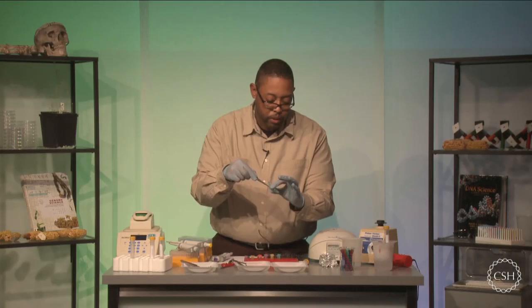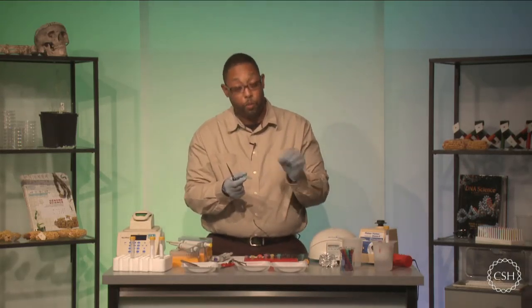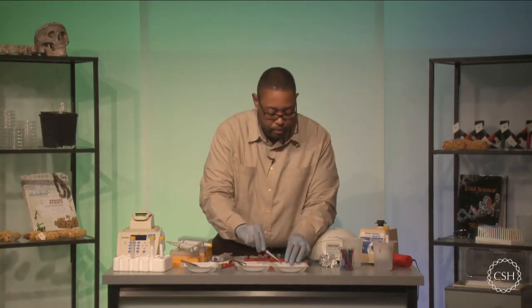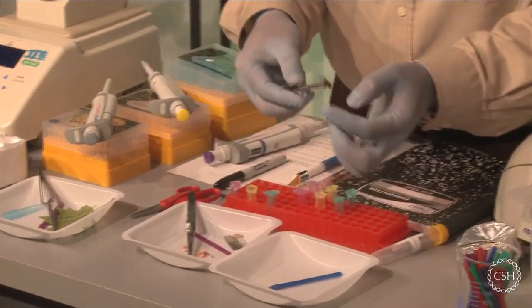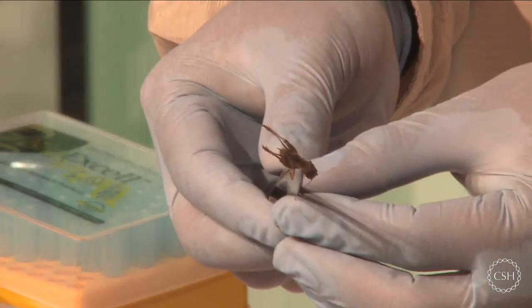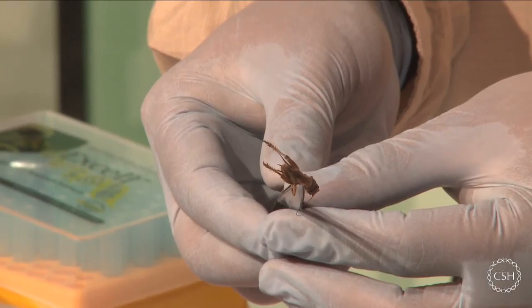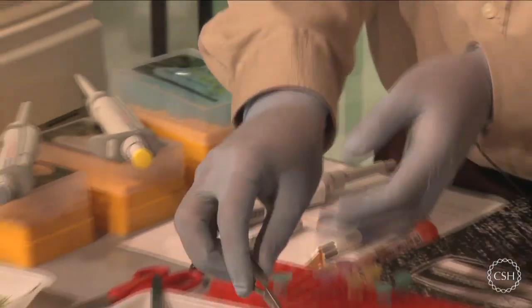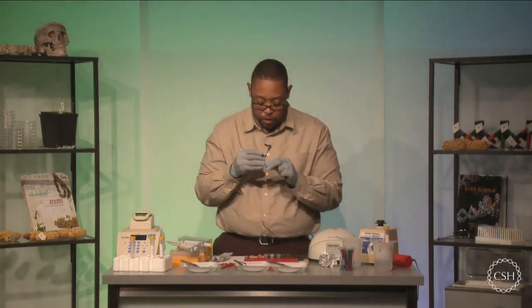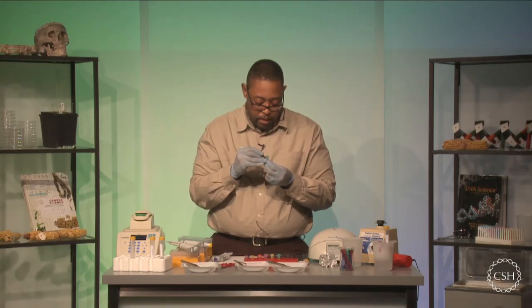Now you may wish to add 2 legs, 1 leg. You can pretty much use any particular number between 1 and 2 legs, but if you have a large back leg, like for example, the cricket here has a large set of back legs. You can use one of those or 2 of the smaller legs here in the front. So 1 of the back legs or 2 of the smaller legs physically in the front. Okay. I just took 1 of the front legs, but that is going to be just enough for me to physically work with here. So I'm going to label this my sample number 3, and that this is an insect.